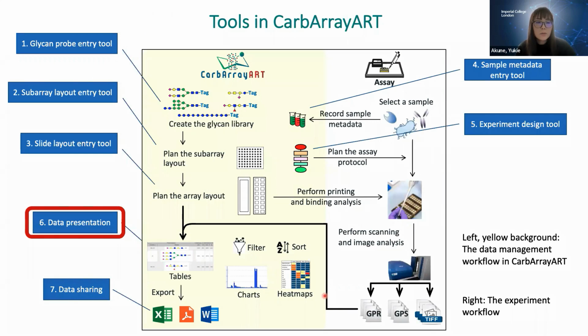Then I'd like to move on to the data presentation view. So after entering all the sample information and the experiment protocol, you are ready to make the tabulation result view. How to create it? You need the scan result file.